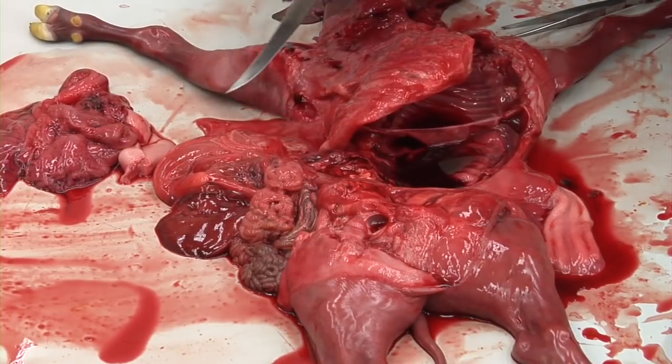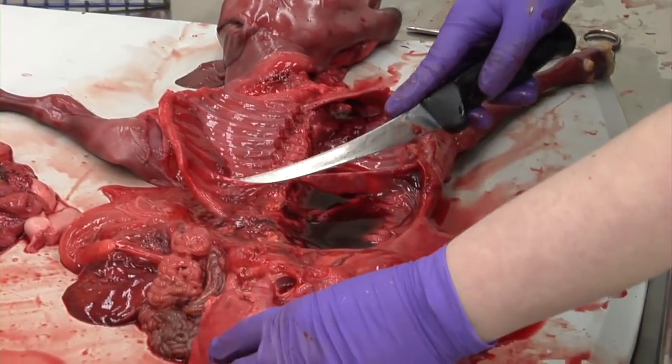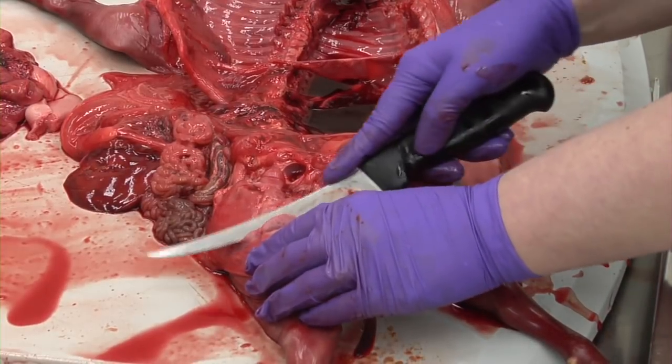Three sections of skeletal muscle from different locations should be placed in formalin. This can be the limbs, tongue, or diaphragm. As with the cardiac muscle, these tissues may contain lesions associated with Neospora caninum.